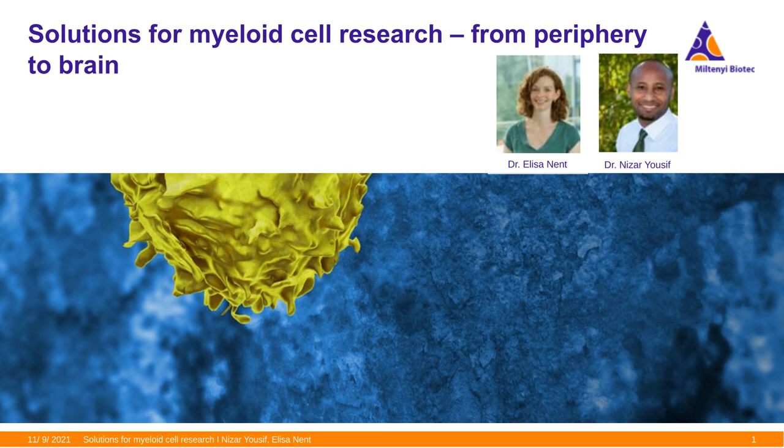And with this ultra microscope blades that are presented, it's really nice. You can image several samples in one row. It's quite automated, so you can have like a batch analysis and imaging. And then in the end, you get really nice 3D videos or images of your brain, and it's really helpful for the connectivity or the interplay of the cells, or for example, also during development.